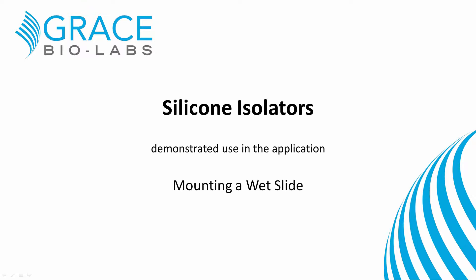This video describes the application of Grace BioLab silicon isolators for mounting a wet slide.